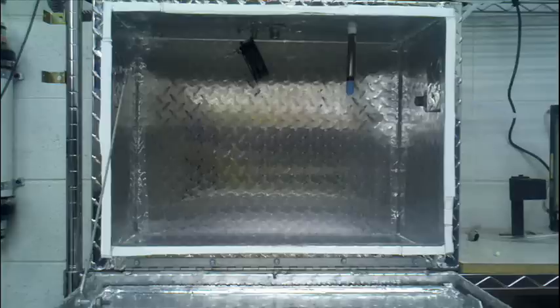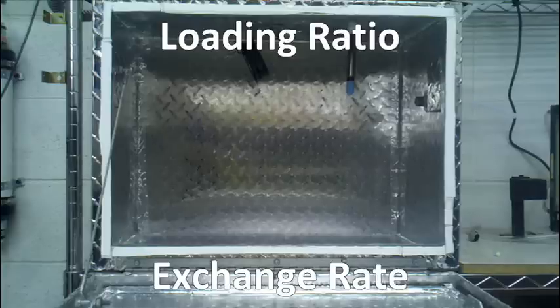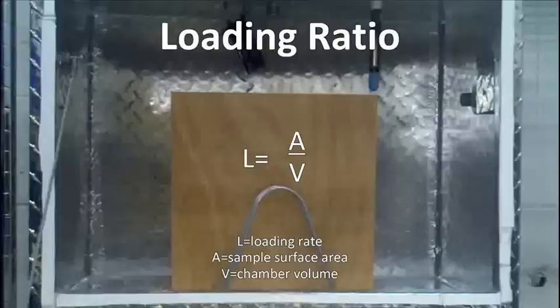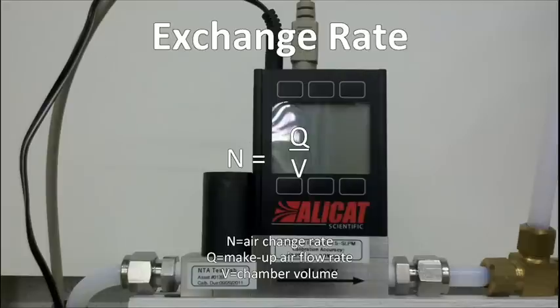There are two main considerations when conducting the test: loading ratio and air exchange rate. The loading ratio is total exposed surface area of each product divided by the test chamber volume. The air exchange rate is the ratio of conditioned and filtered outside air brought into the chamber to the chamber's volume per hour.